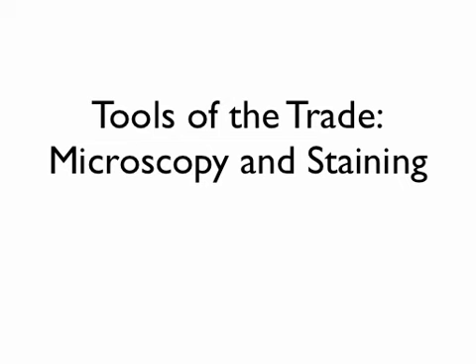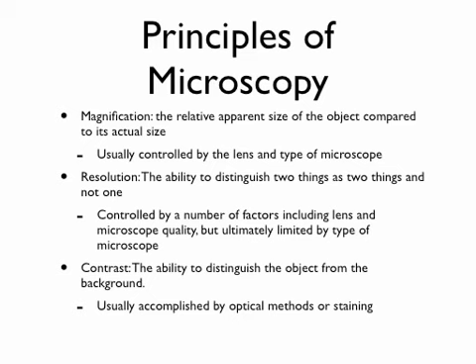All right, you guys are going to want to take especially good notes for this because I'm going a little bit quick over some of this material with the assumption that people are sort of familiar with microscopes. Microscopy. The discovery of really good microscopes was what kicked off the science of microbiology, and microscopes are still to this day the most important tools that we use in microbiology.